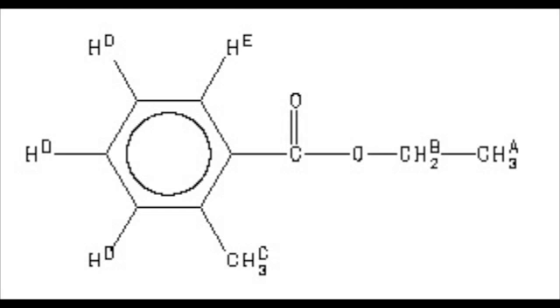All right, so first of all, look at that CH3 with the C next to it at the bottom there. That CH3 with a C is next to no other carbon that has a hydrogen. So that must be the singlet that we saw, due to a phenomenon known as spin-spin splitting. Because those hydrogens are not next to any other hydrogens, the local magnetic fields induced by the nuclear spin of other protons will not cause a multiplet of peaks. Rather, there's just one singlet observed.